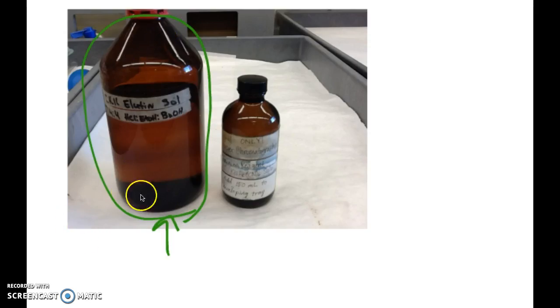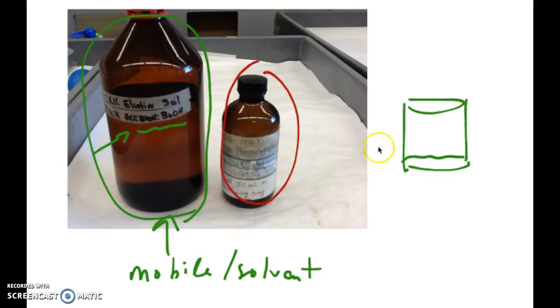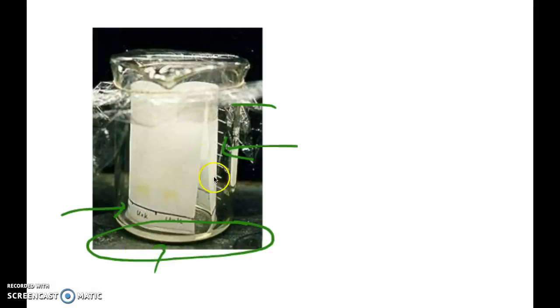So the solution you're going to use to actually run it, the solvent system is this solvent system right here. So it's not water, but it's a mixture of some organic solvent. You're going to pour that solvent into a beaker. And they tell you how much to get so that it just barely covers the paper at the bottom. And then you put the paper in there. Paper has to be rolled up looking like this.